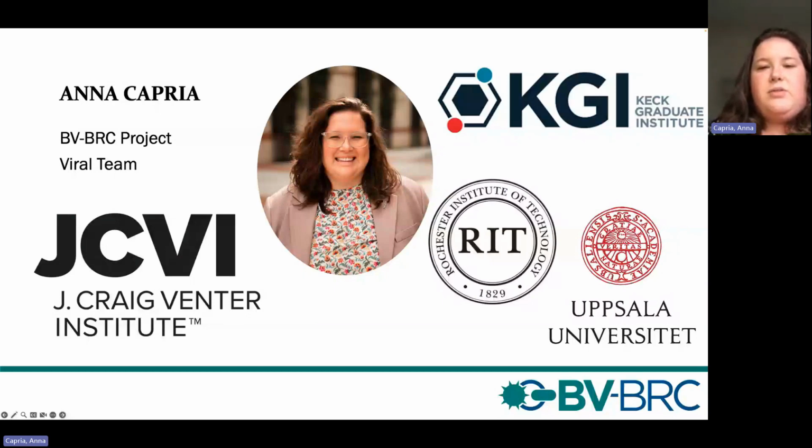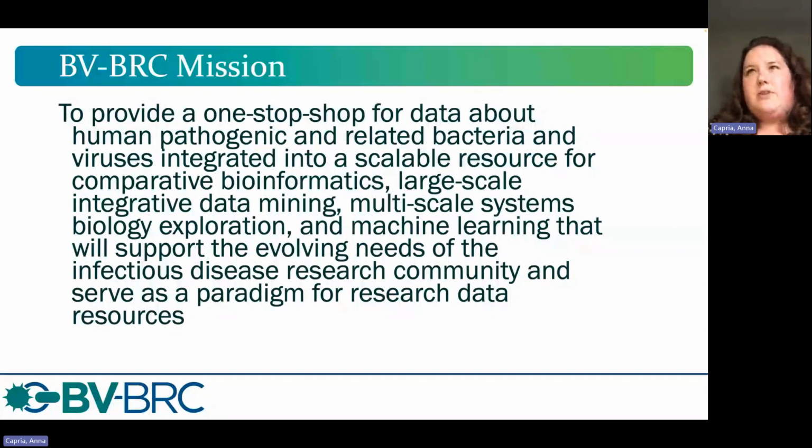Similarly, I wanted to just run through what the BV-BRC is. If you're not familiar, we're a one-stop shop for data about human pathogens and related bacteria and viruses. We have a resource that has a bunch of bioinformatic tools as well as a robust database that has the genomic data for those pathogens. And thinking about our tools, we have a bunch of different tools for analysis. So I just wanted to go over some of the tools that you can use for annotation today.